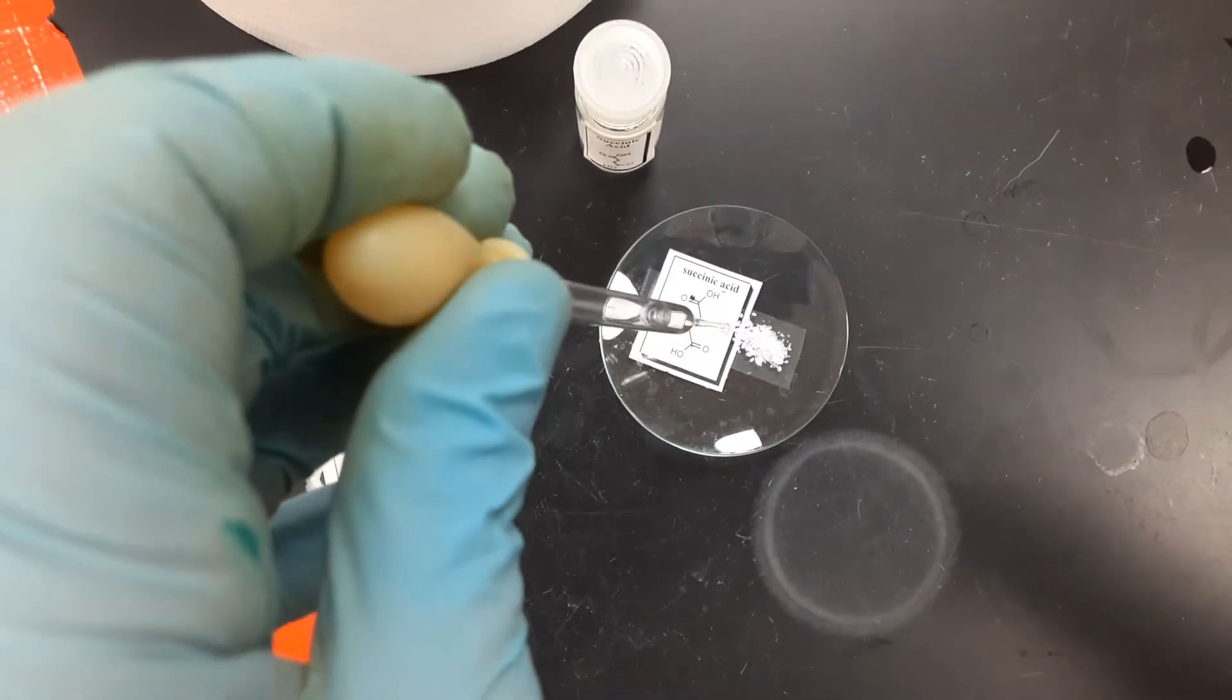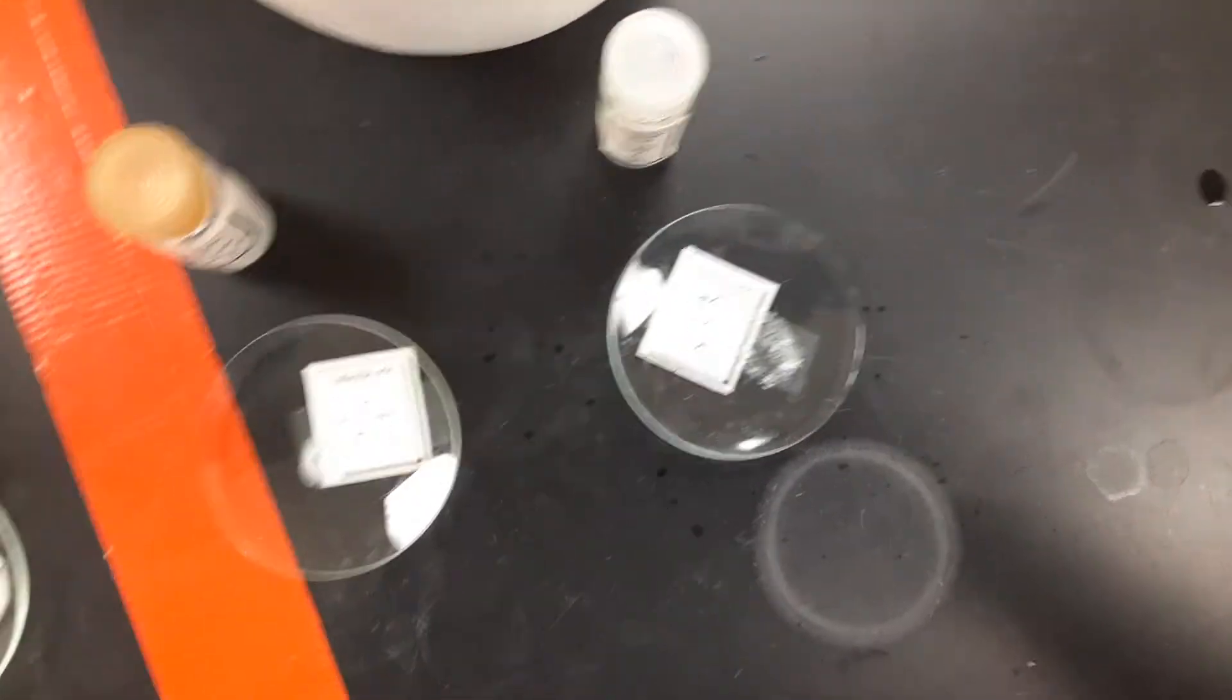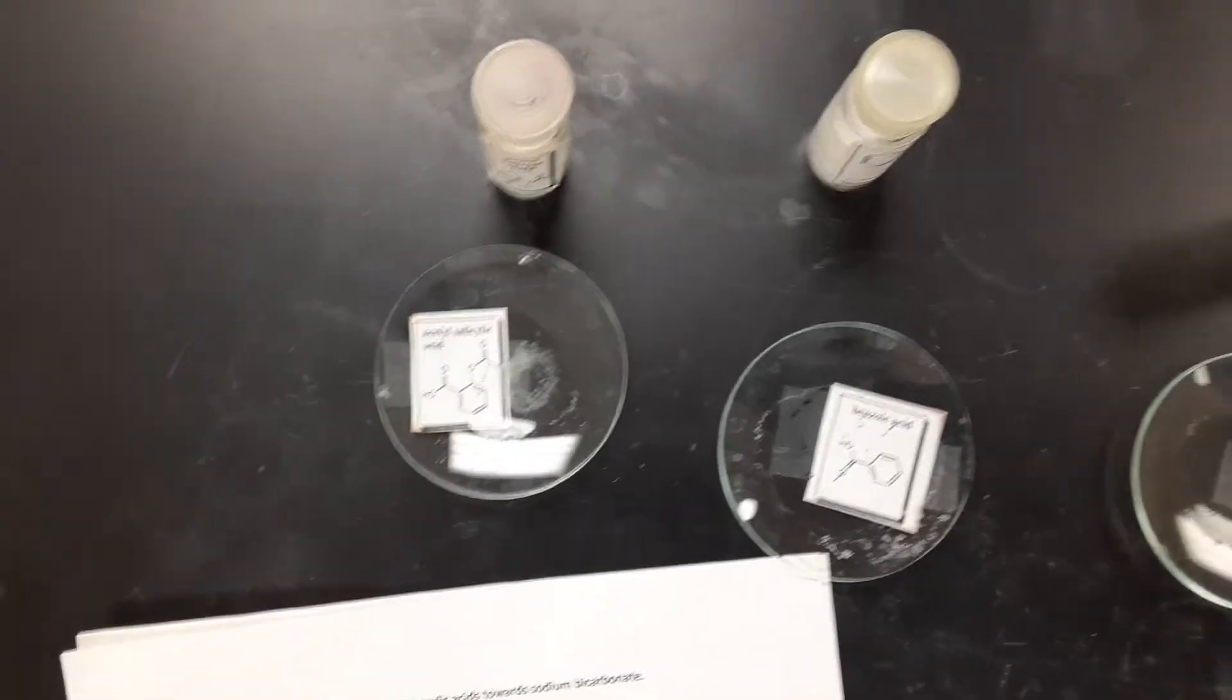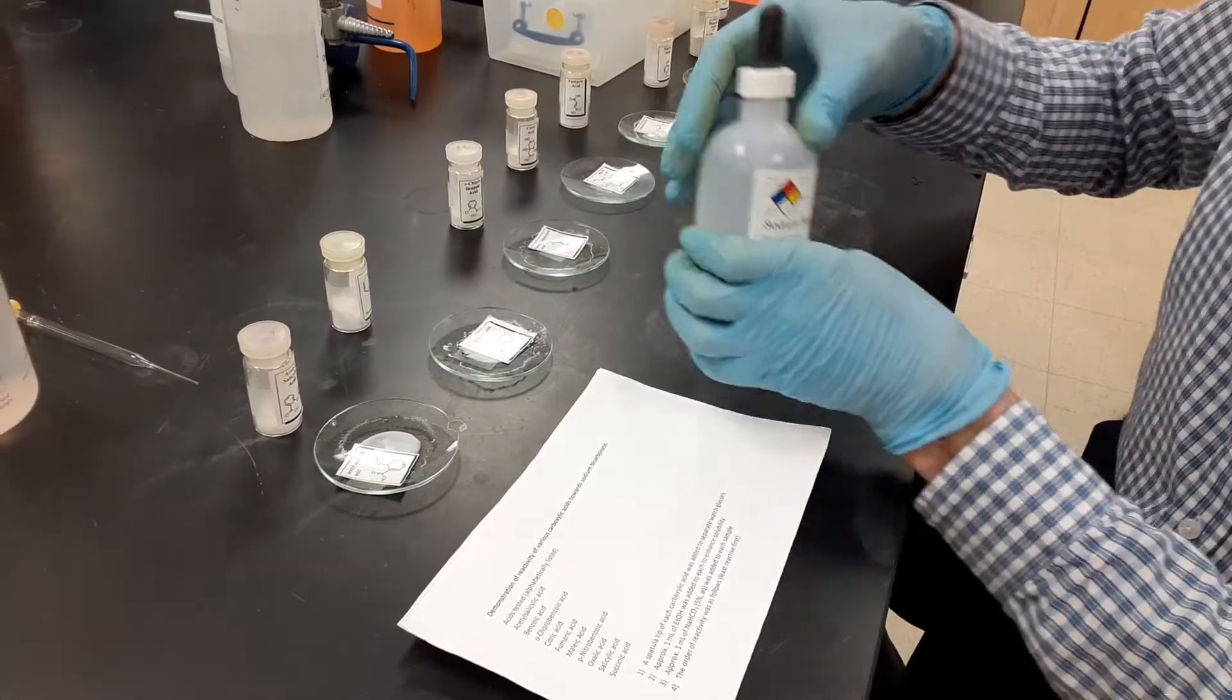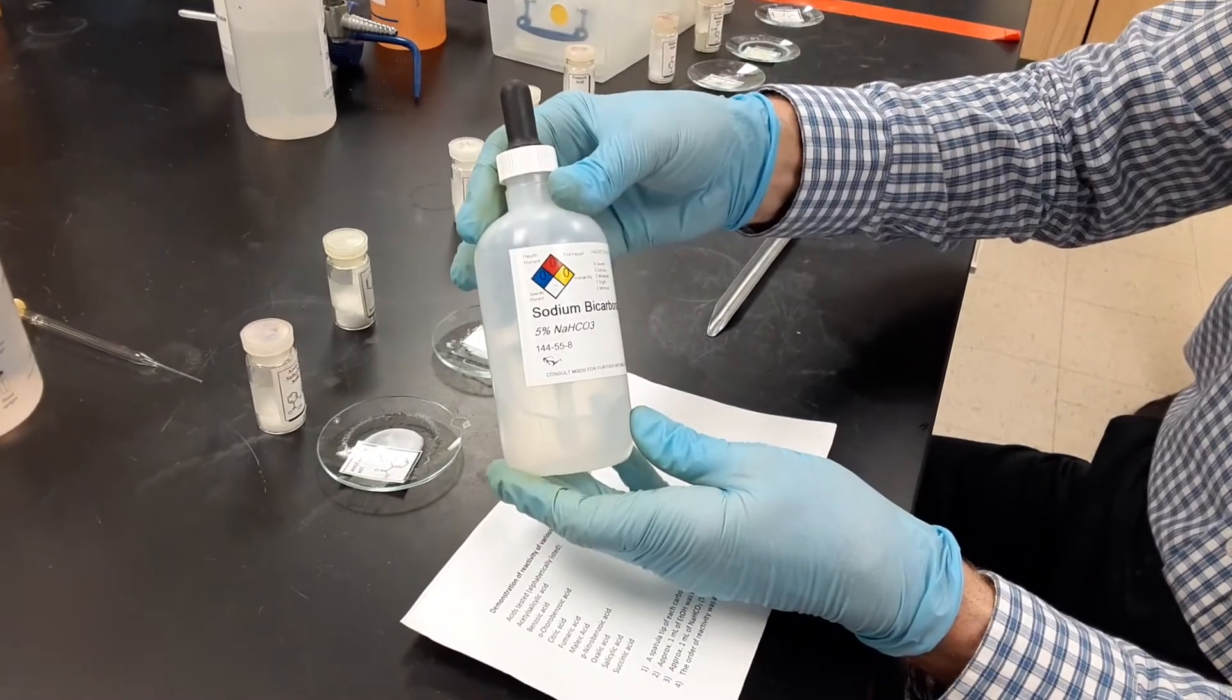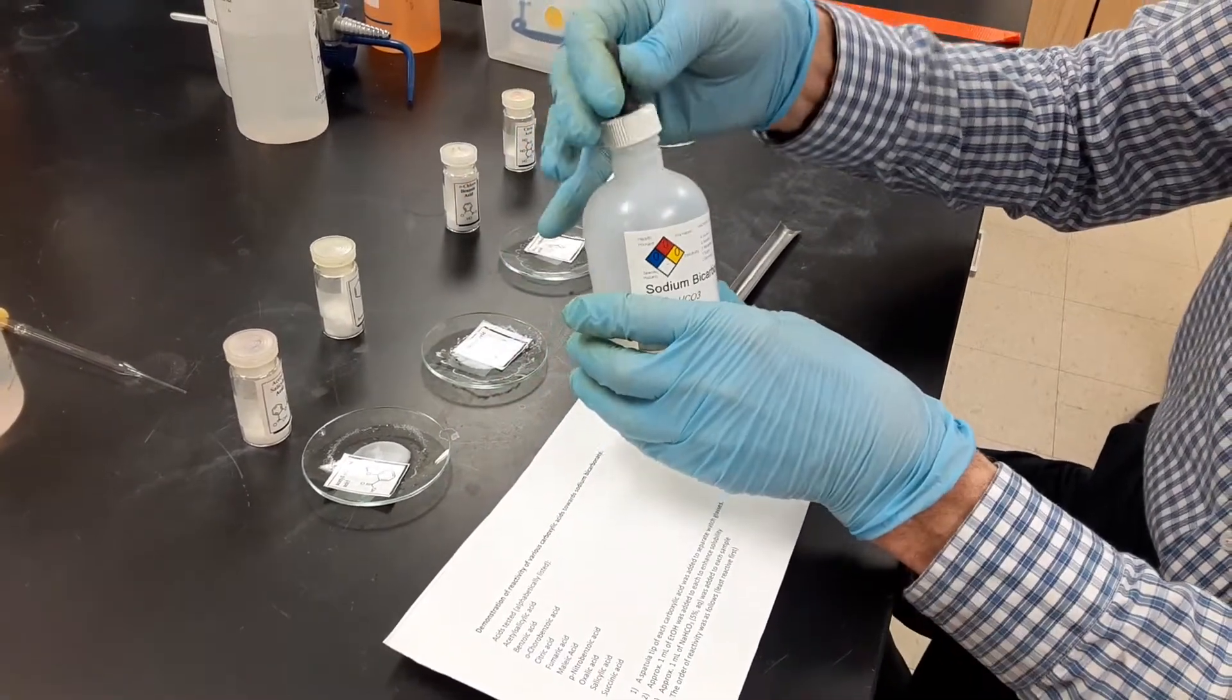We're adding one milliliter of ethanol to each of these watch glasses to enhance the solubility of the carboxylic acids. I'm going to be adding five percent sodium bicarbonate to each one and we want to see which ones form bubbles fastest.